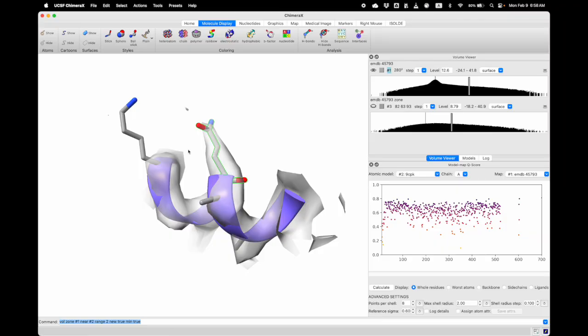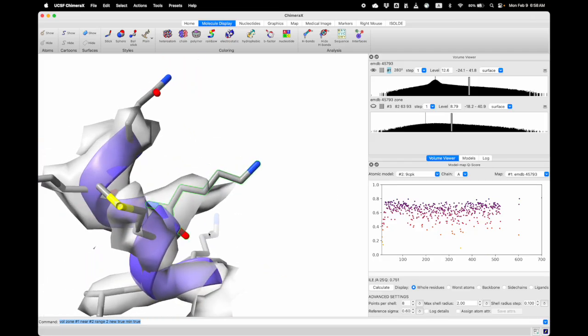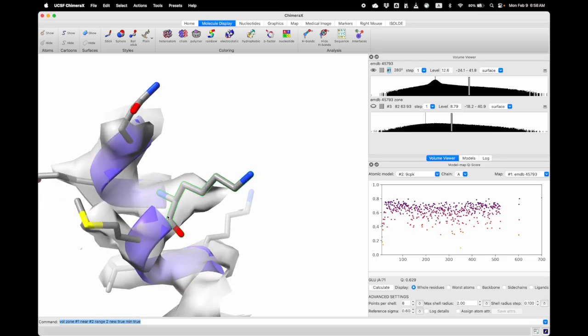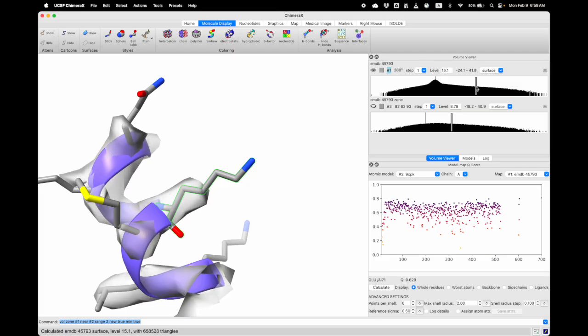Some residues might not be resolved, as we talked about before. This is a long residue, which is usually flexible. If I click on a point with a low score, these are residues that tend to be not resolved, like this one. Here the backbone is resolved, but as you go further away, the density becomes weak, and we consider these as partially resolved or less resolved.